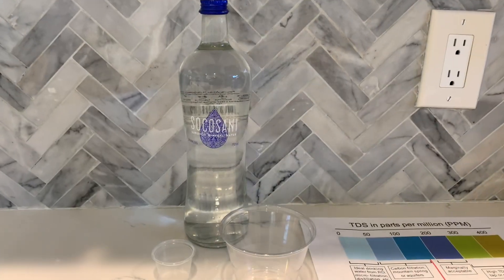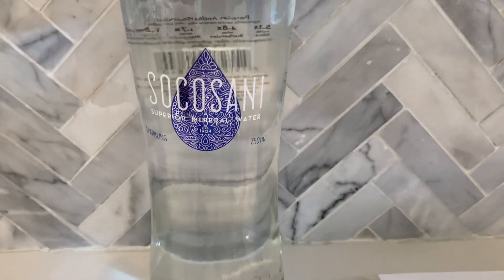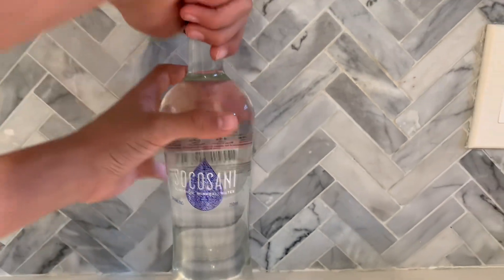This is Socosani Mineral Water. It is sourced from Socosani Valley, Peru. We bought this bottled water for $4.99. Let's test the results.